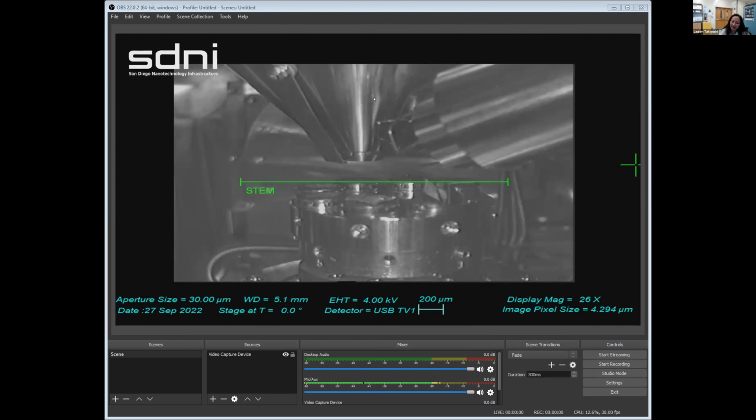And now why SEM has such higher resolution is because we use electrons instead of light. Electrons are much, much smaller, and more technically, they have a shorter wavelength than visible light does. The resolution of SEM is technically limited by the wavelength of an electron, but for practical reasons, and because of user issues, it's more limited by the electron sample interaction, since SEM samples have to be able to conduct electrical charges to some extent.